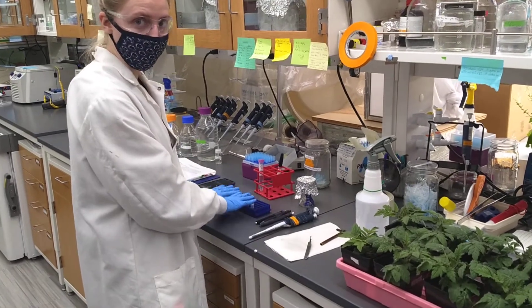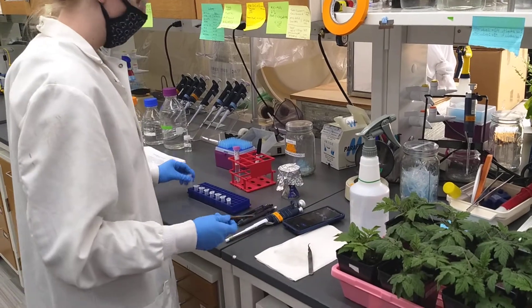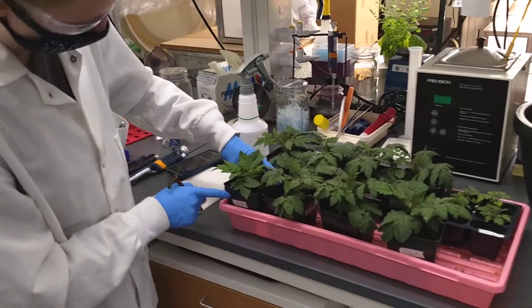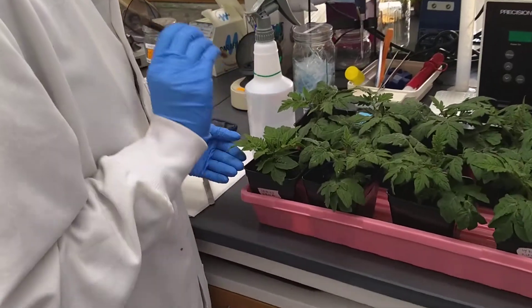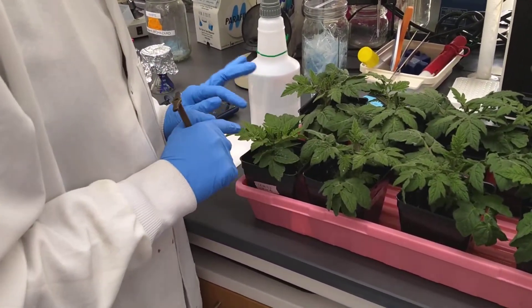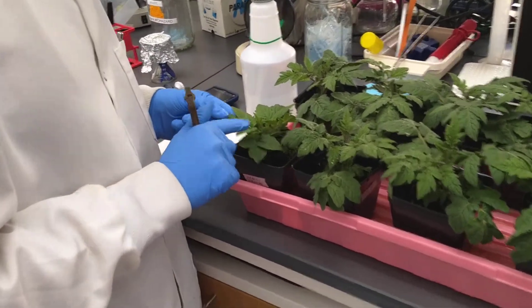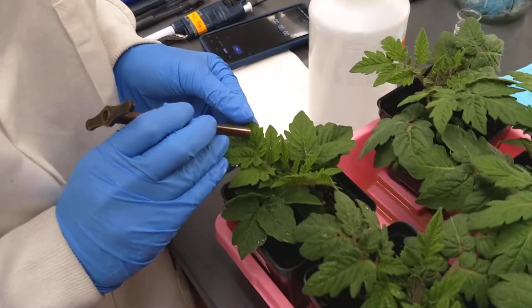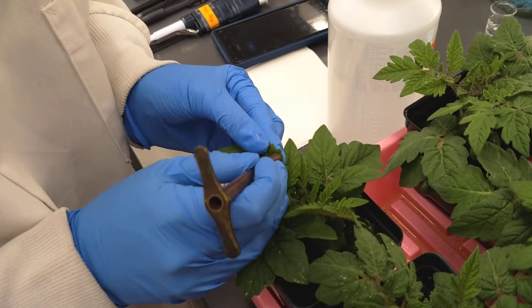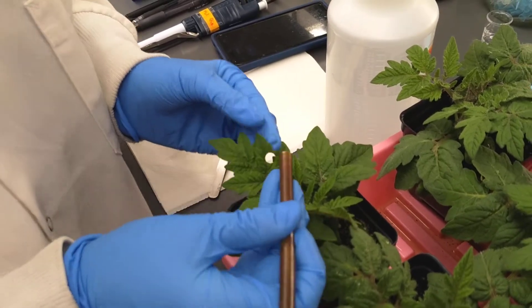My microcentrifuge tubes are already labeled, so we're going to go ahead and get started with number 7. We're going to take a punch from a newer leaf — not a completely baby leaf, but a newer, fresh leaf. We don't want to go completely old; we want to be on the newer side. Right about this size leaf is perfect. We're going to take it from the side of the leaf, trying to avoid getting a lot of the vein.